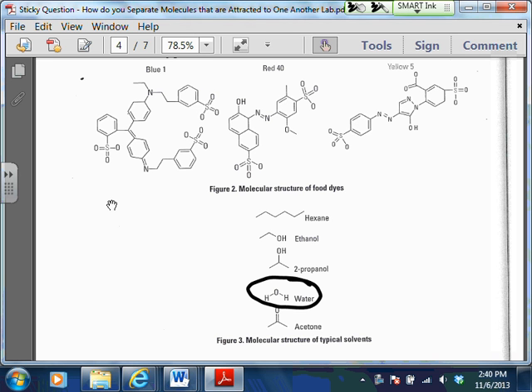Probably that's where we're going to get our best RF values from tomorrow. That's my guess, and that would have been my guess initially also, for reasons we'll talk about in a minute. The next best, I would have guessed maybe the 2-propanol, and then maybe the ethanol after that. Those both have hydrogen bonding in them, just not as much hydrogen bonding as the water, which has two places where it can hydrogen bond.